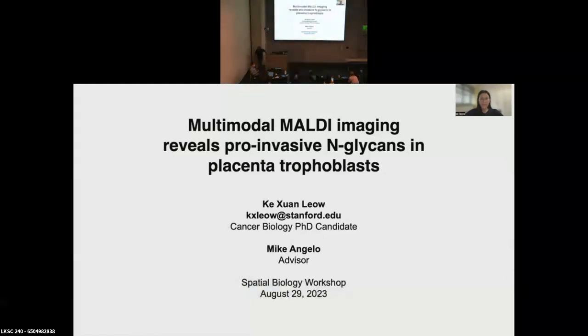Hi, my name is Kay, and I'm a graduate student in the Angelo lab. Today I'll be talking about some of my work using a multimodal MALDI imaging workflow to identify N-glycans that are associated with pro-invasive trophoblasts.